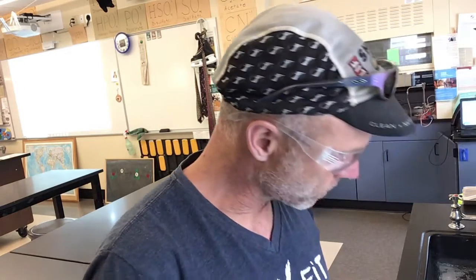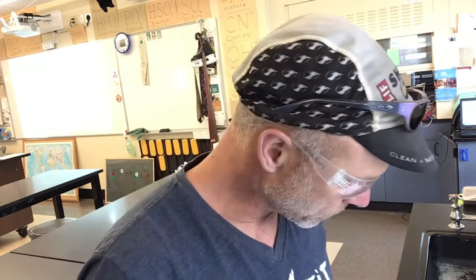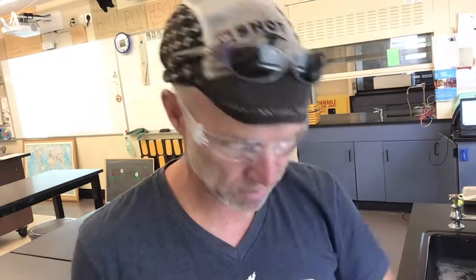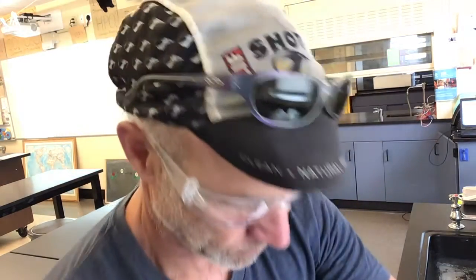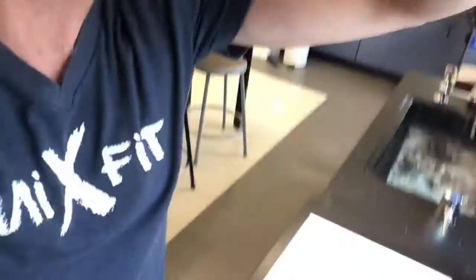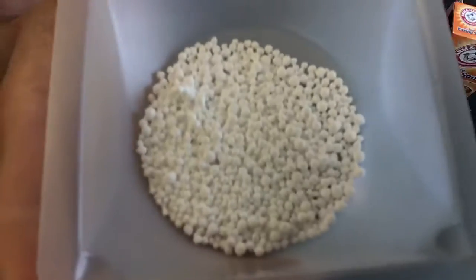For research question number 1, you're asked to make and record observations of the 4 chemicals. So let's look at calcium chloride. Here's the calcium chloride. I'm going to put it in this weighing dish. I don't know if you can see that. Oh, it's not very good. All right, so there's the chemical.